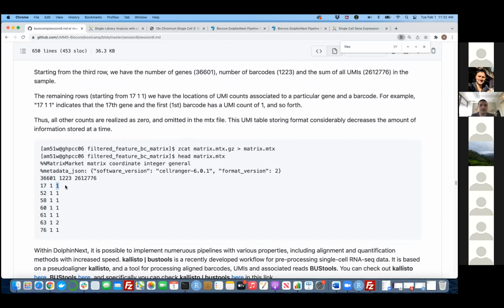So basically what's happening is that you have a joint table, but this is kind of like an aggregated row-based 3-column table, where it shows you this row name, this gene, and this column has number 1.